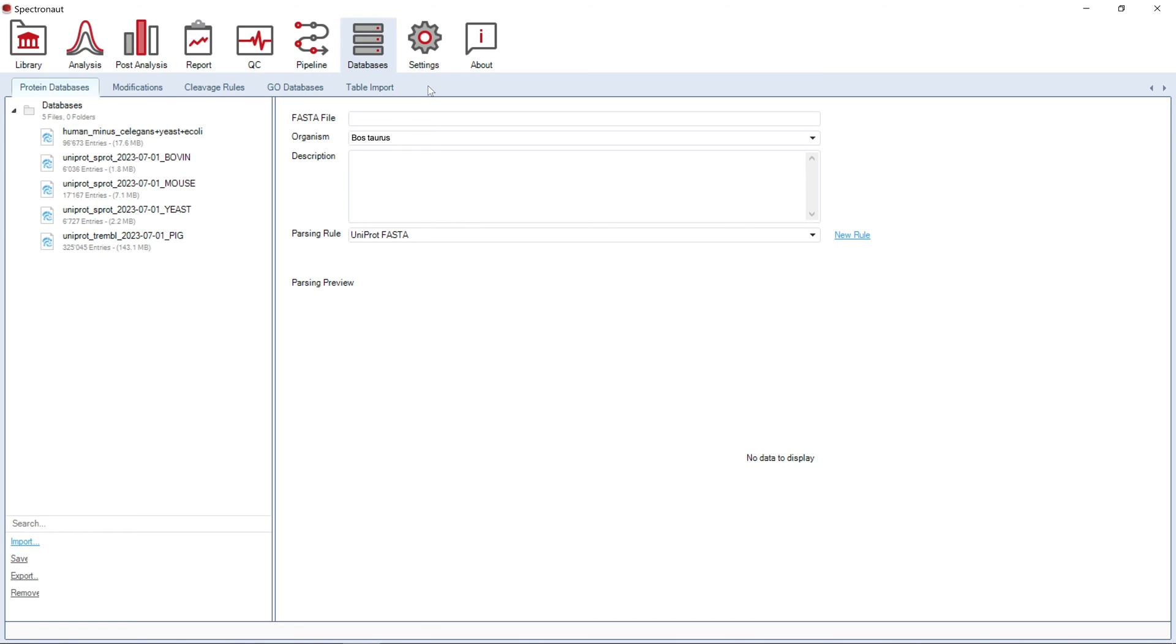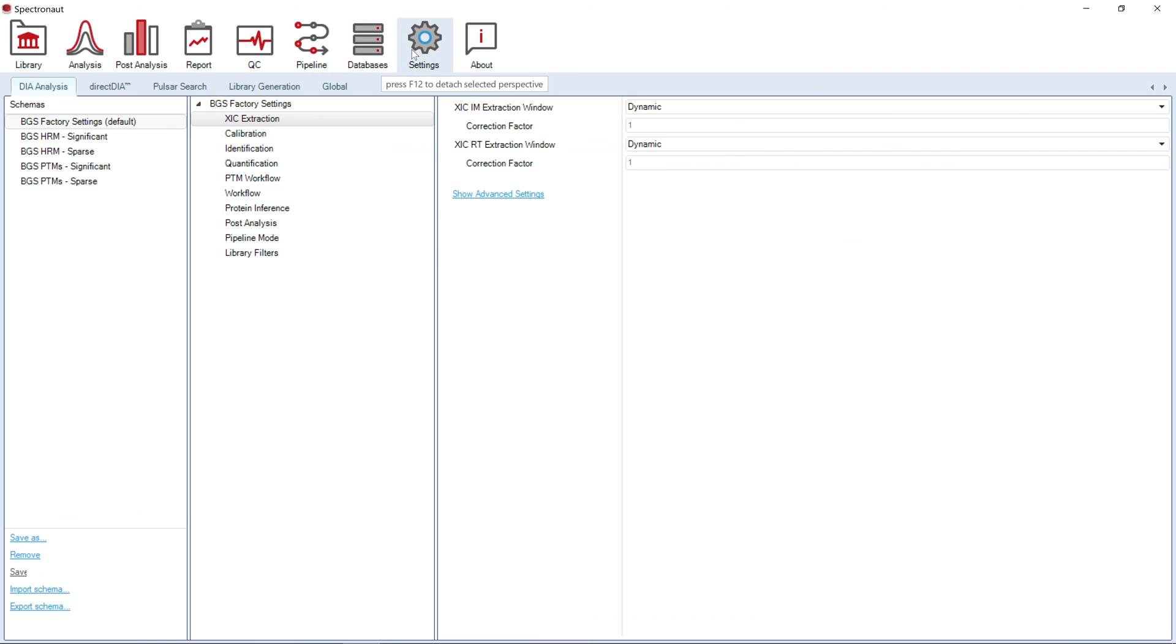In the Settings Perspective, you will be able to generate your own settings schemas for all the workflows available in the software.